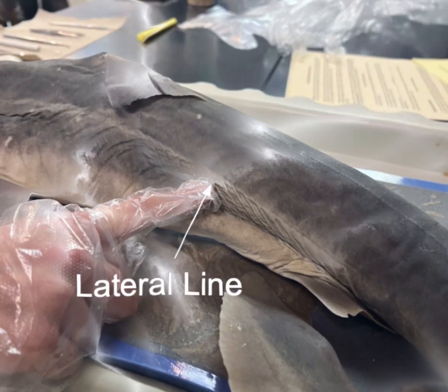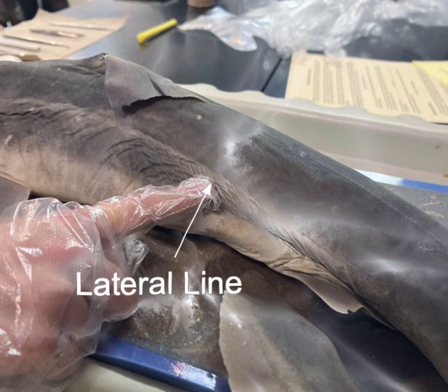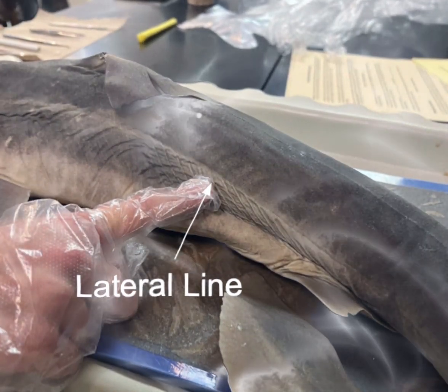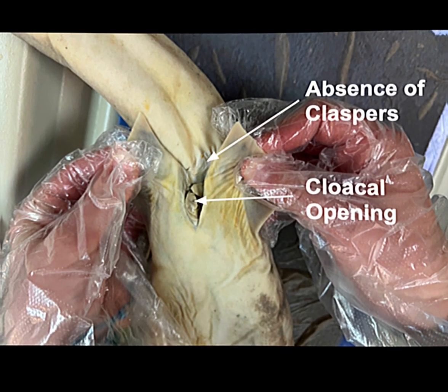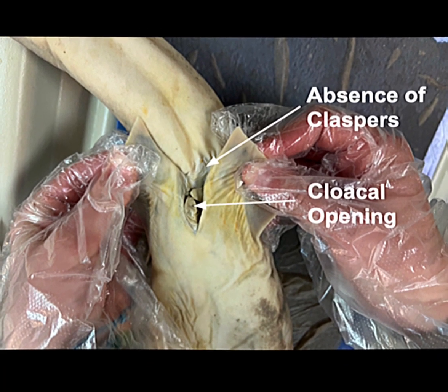Then there's the lateral line, a light-colored horizontal line along the sides of the shark, made up of tiny pores that lead to receptors that are able to detect changes in water pressure in the surrounding water due to movement. As you can see, there are no elongated claspers in the shark, which means it's a girl, as only boys have them.